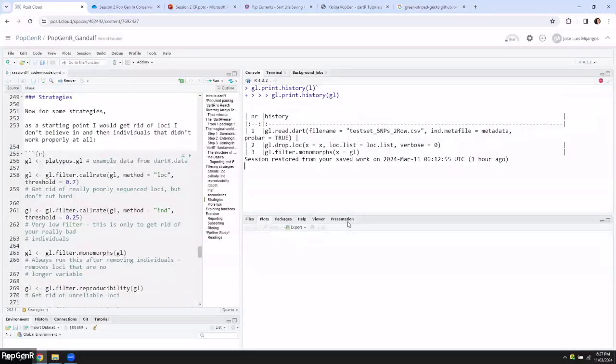Just a quick question about reproducibility. With our samples, we normally run a lot of replicates. We use scat samples, so the quality is generally pretty poor. So does the filtering in that case merge the two samples, or does it just give an indicator of how good it is? So in the first run, it's used as an indicator of how good a locus is.